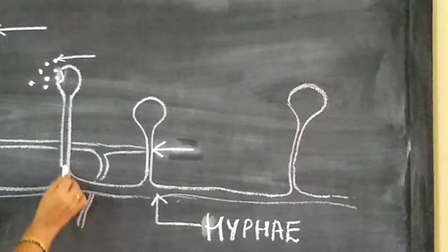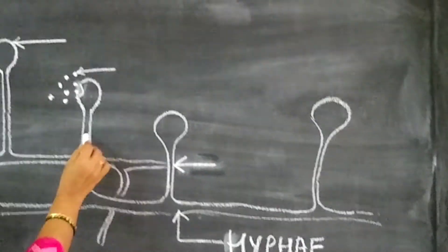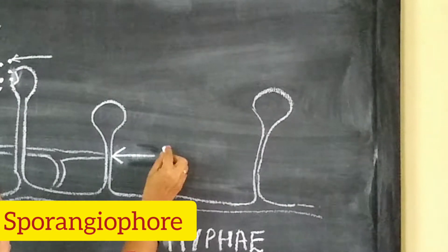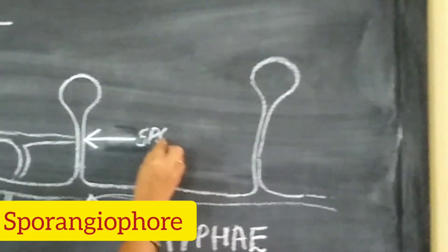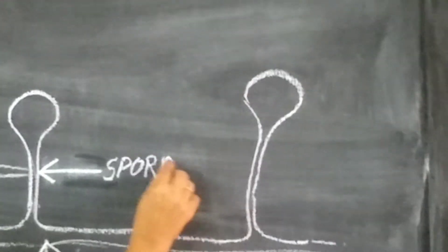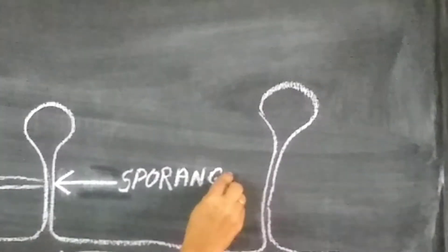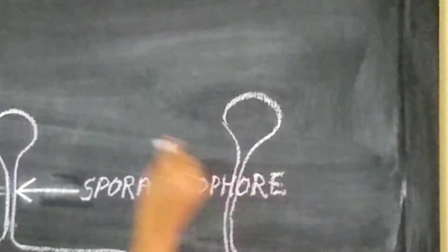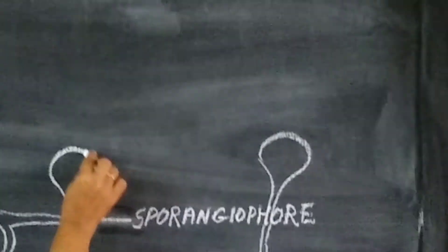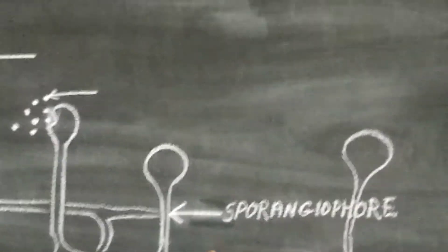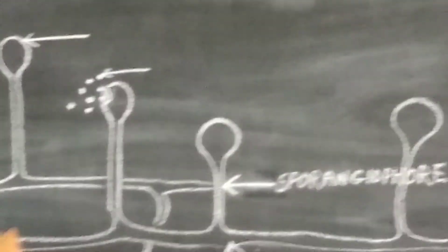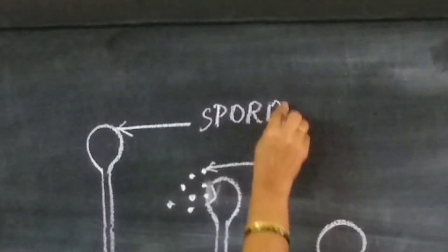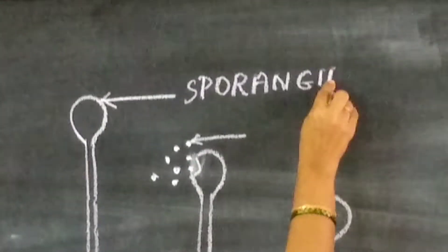The standing threads are known as sporangiophores. The bulb-like structures at the tip of the sporangiophores are known as sporangia.